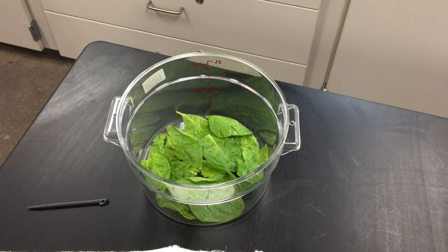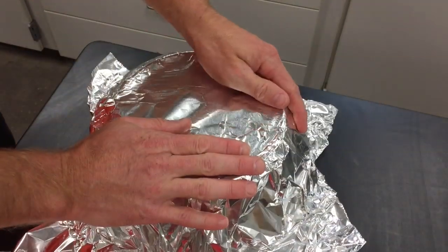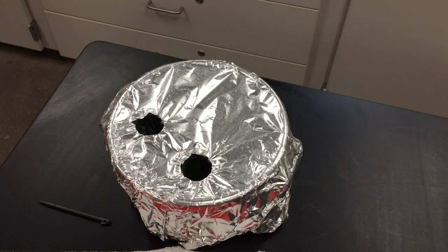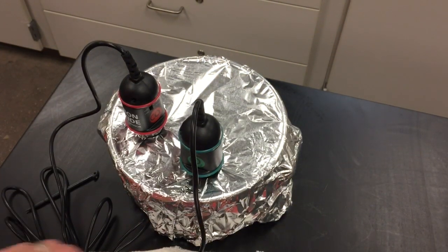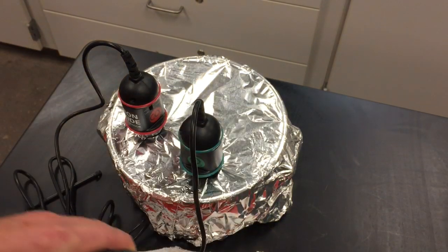If you're setting up your experiment to run in the dark environment, take some aluminum foil and cover the chamber up. Alternatively, you could put it in a drawer or dark place in the classroom — it doesn't necessarily need to be covered if it's already in a dark location, but if you're leaving it on your table, it does need to be covered. Insert the carbon dioxide and oxygen sensors, then wait five minutes for the sensor readings to stabilize.